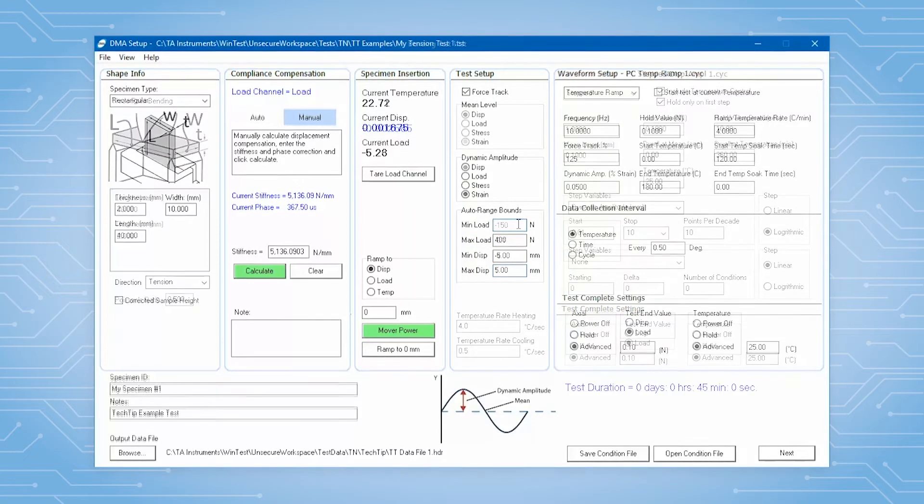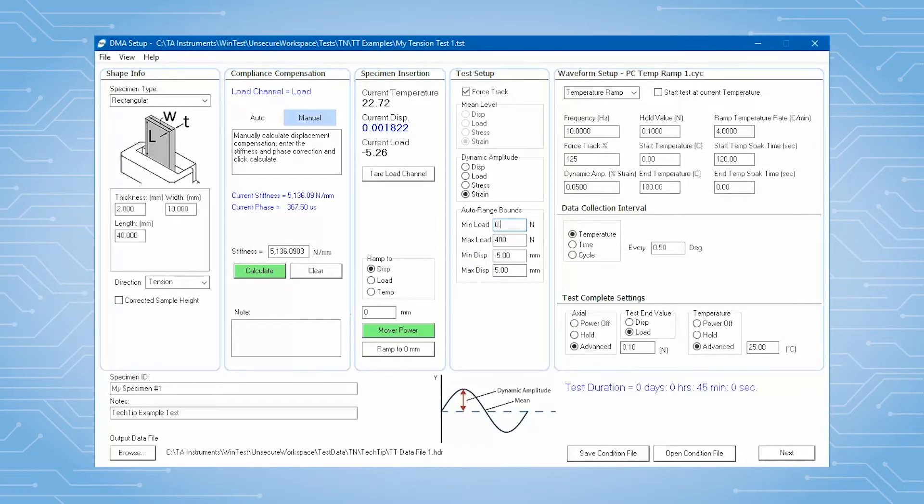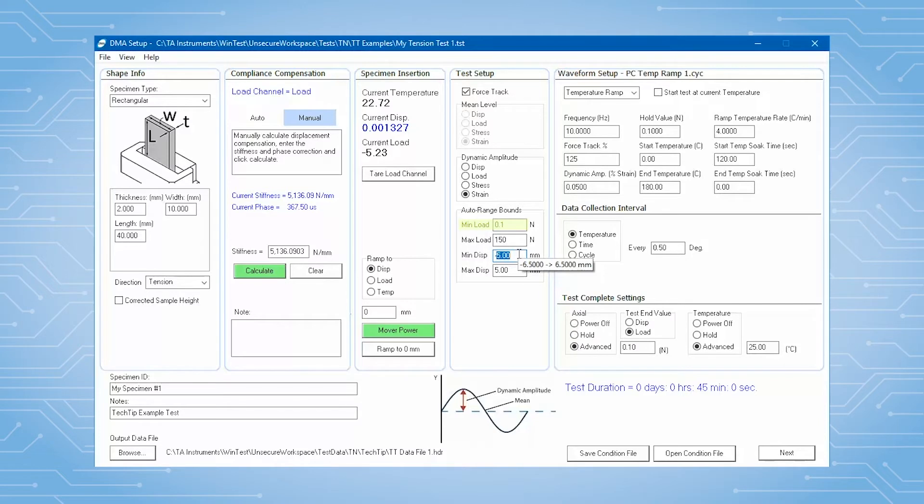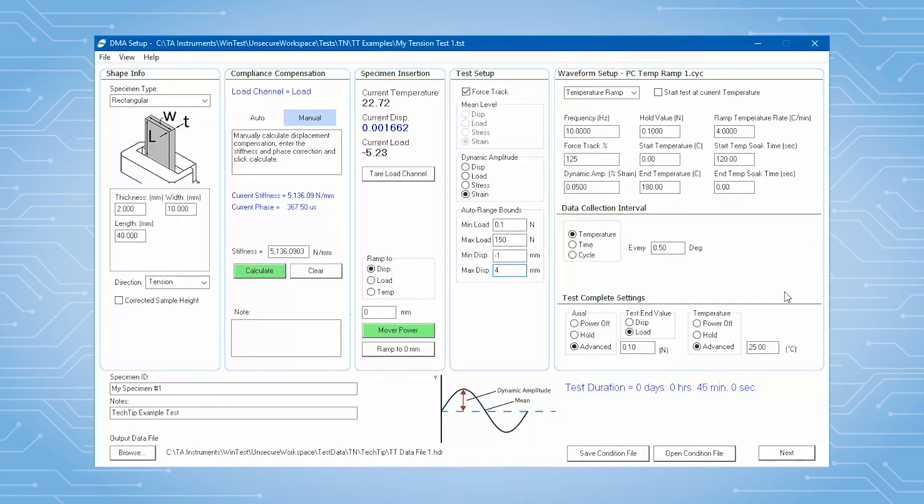And for tension, you will ensure that the sample doesn't buckle. A small load in the direction of loading is set to make sure the test continues as planned.